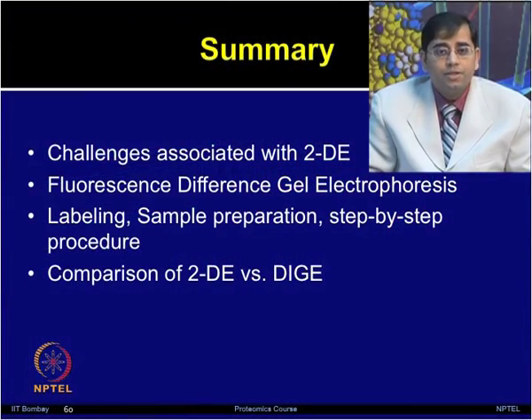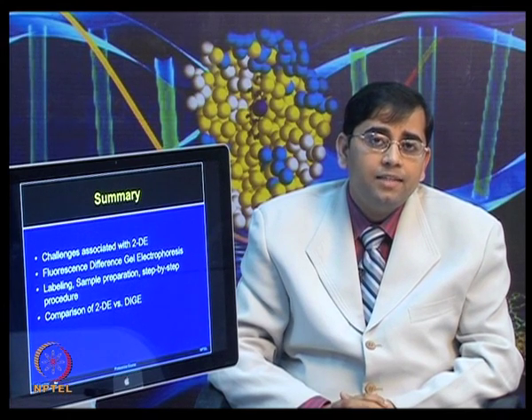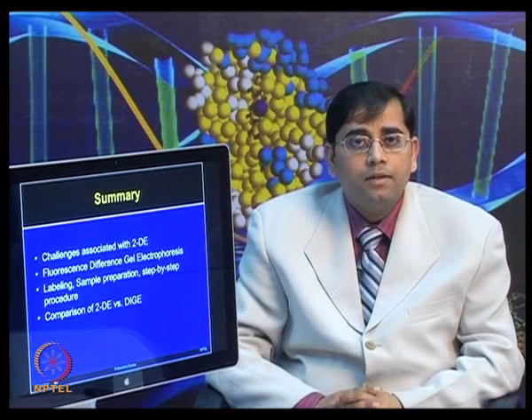So, in summary, in today's lecture we talked about different challenges associated with two-dimensional electrophoresis. Then we looked at the DIGE workflow, the different concepts involved, as well as how to do the labeling of samples, how to make internal standards, and then we saw the steps in animation. We finally compared the 2D method and the DIGE method, and I gave you an interactivity option to perform an experiment by using 2DE or DIGE, and you gave the right answer of doing the experiment with the DIGE method. So, overall from this whole experiment you should be able to conclude that DIGE is a better way of separating proteins, and it can still provide you very useful quantitative information in gel based proteomics.